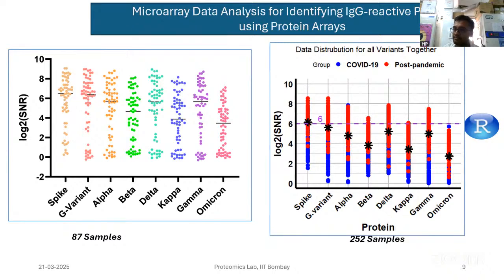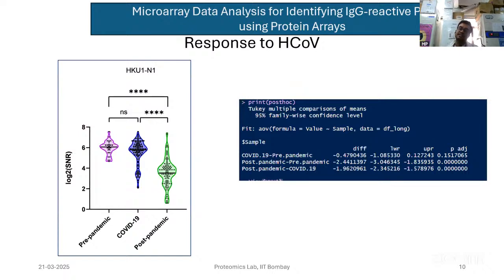That's why, in this way, we just wanted to show the variations in different samples for a feature using this plot. So now the next part. I'm going into a bit of detail on the statistics, but not in much detail, just glimpses. After doing that, there are different strategies involved for the data analysis. We can't take an instant call on which statistics to be taken forward. In this case, why ANOVA?